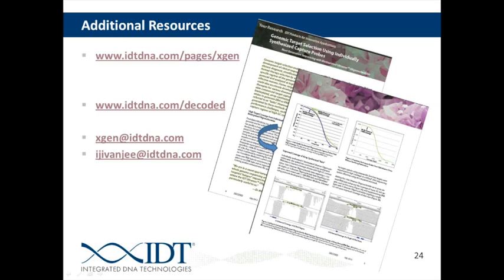The coverage plot I showed you earlier in the presentation, that increase in performance is actually a GC-rich region. The reason for that is that we QC the probes before we ship them out. So we verify the presence of a GC-rich targeting sequence before it's shipped out.